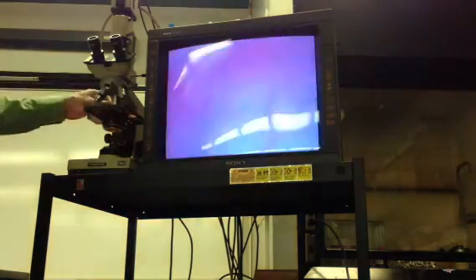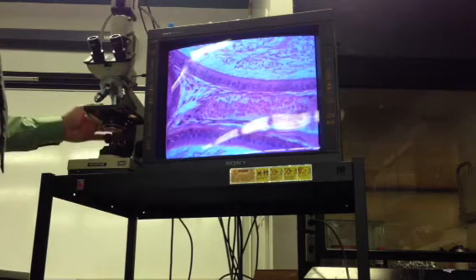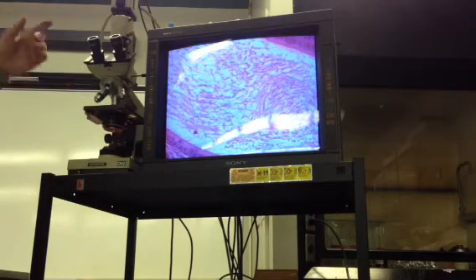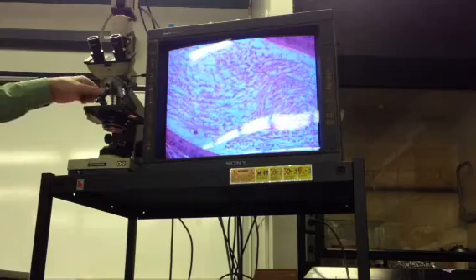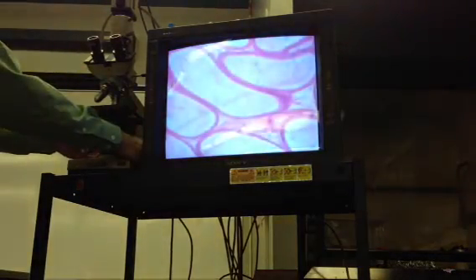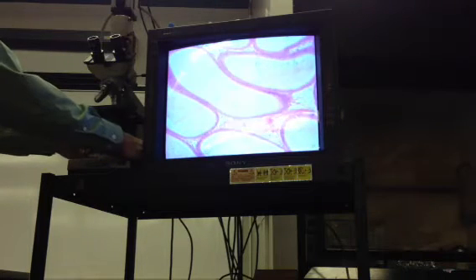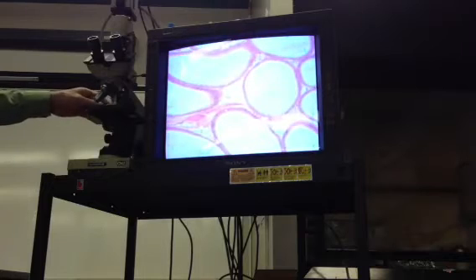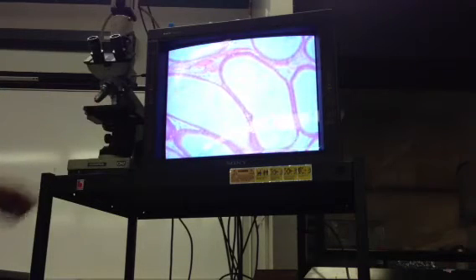Here's an epididymis. The key characteristic before you even see it, do you remember? Sperm. Sperm, yes. And there they are. So this would show up pretty well on high power in a regular microscope, or maybe a little easier to show it here. Even though sperm are very small, that's pretty obviously the epididymis, the lumens.